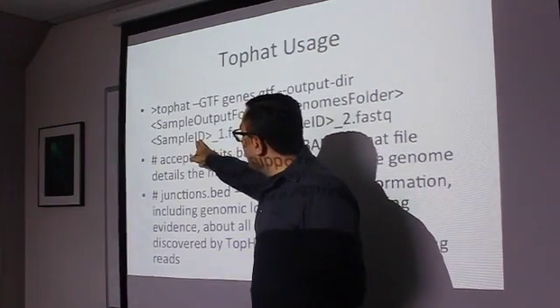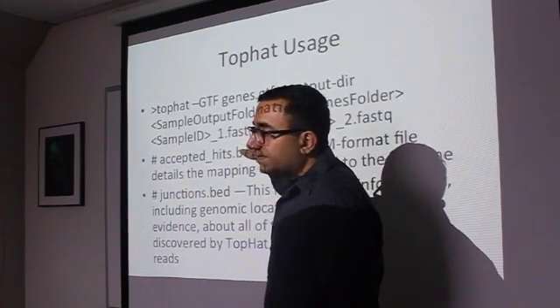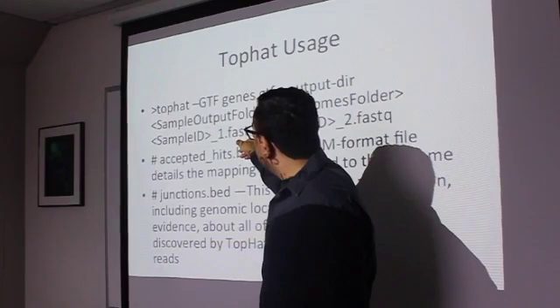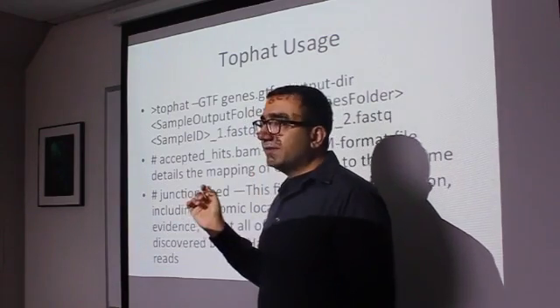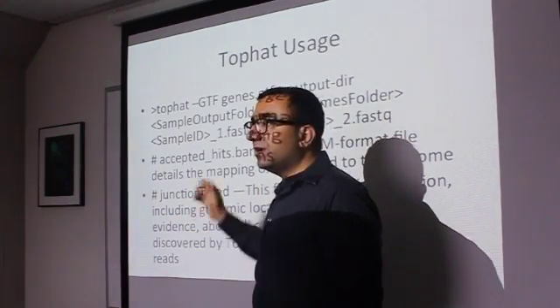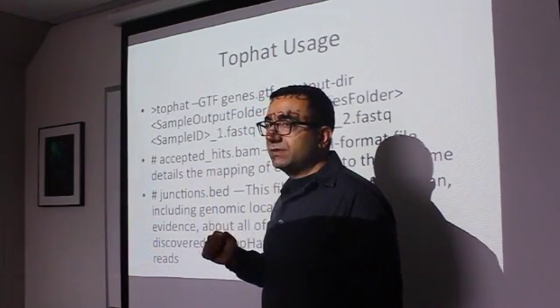Say this was sample 1_1, you can do sample 2_1, specifying that it's the same sample, but you separate them with commas. And when you put a space, it changes over to the next sample. Space means that the separator is for the next sample. So you can align multiple samples at the same time using this.